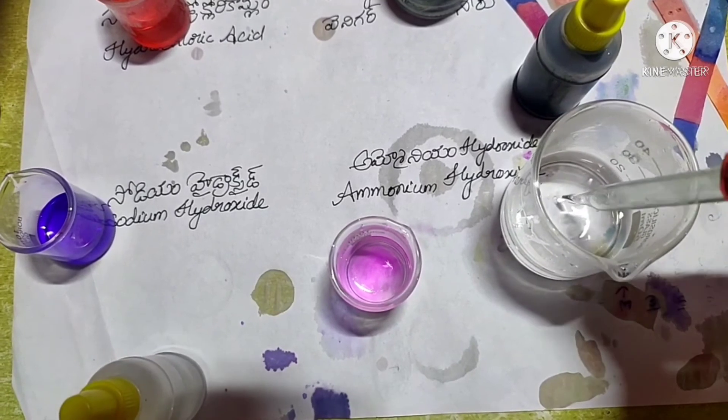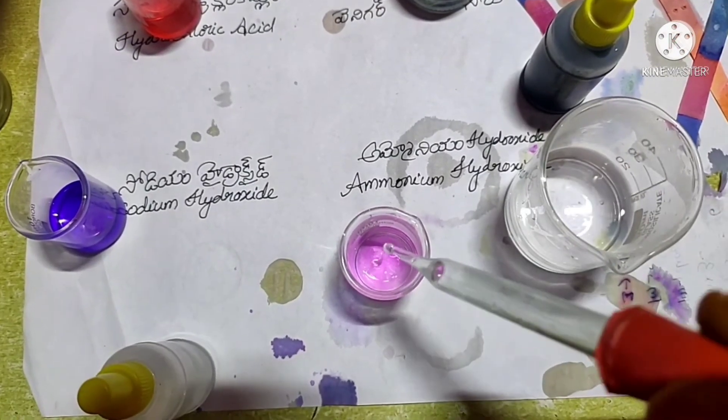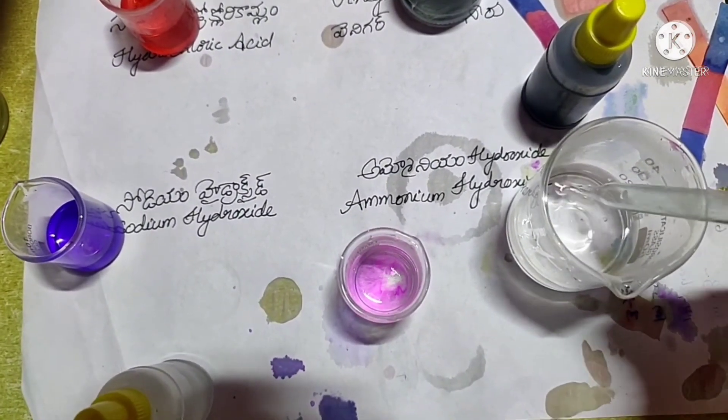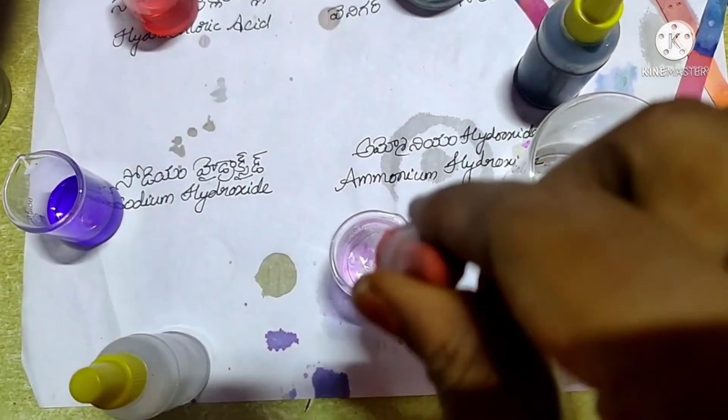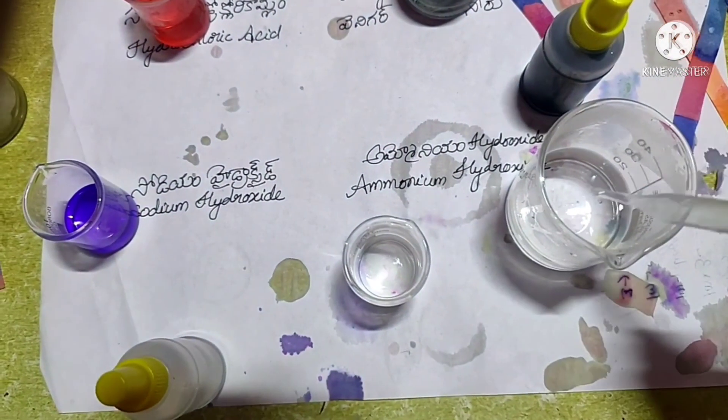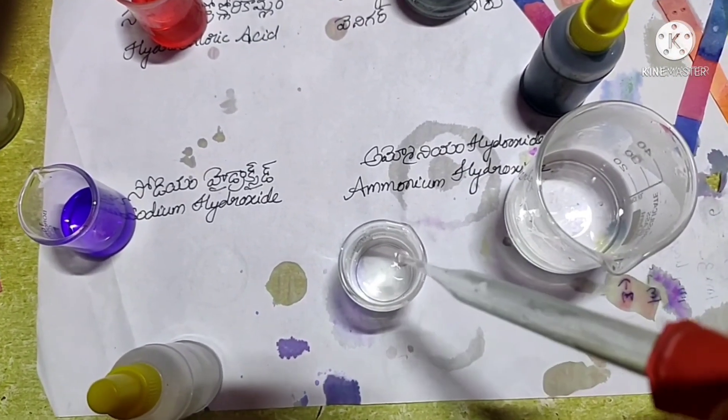Now add one more drop of hydrochloric acid to the solution. The pink color disappears - it has again become acidic. We can conclude that acids react with bases to produce salt and water.